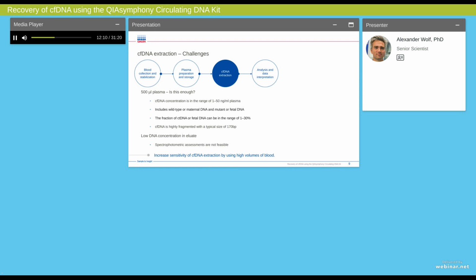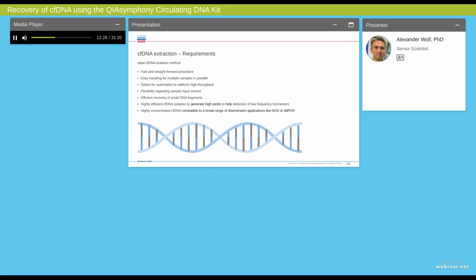Real-time PCR or digital PCR are the preferred options for a reliable quantification. But even for the PCRs, a bias in the total quantification, for example due to the choice of the target or amplicon size, should be considered. That's why we often prefer only a relative quantification to a reference method or reference conditions to assess the extraction efficiency.